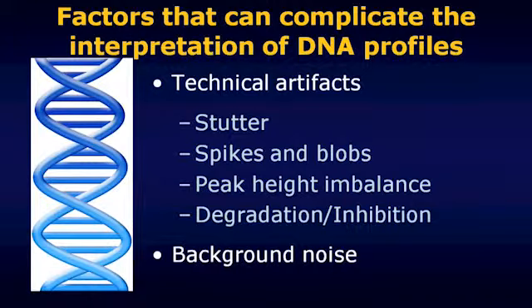Often they can be recognized. When they are recognized, at the very least, they raise some questions about how certain we can be about the reliability of the test and the conclusions that can be drawn from it. Sometimes serious concerns, sometimes not as serious. All right, so those are technical artifacts that can complicate the interpretation of DNA testing results.